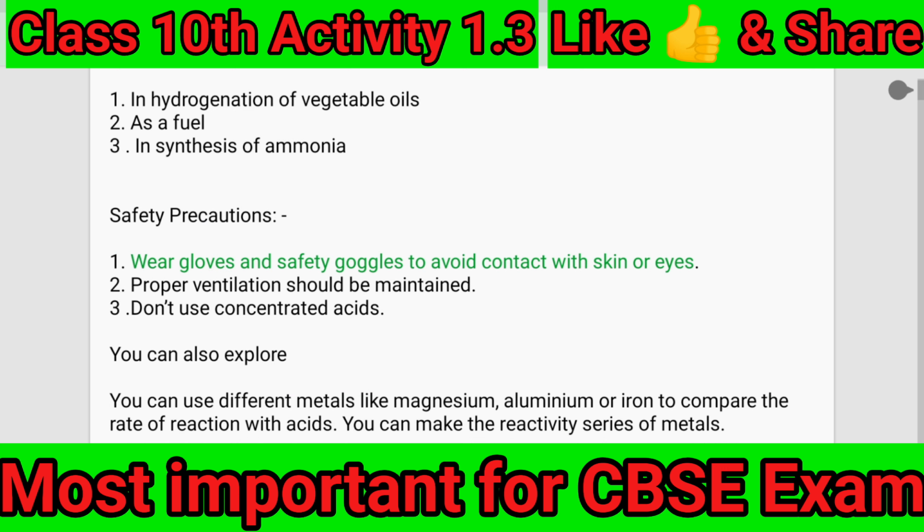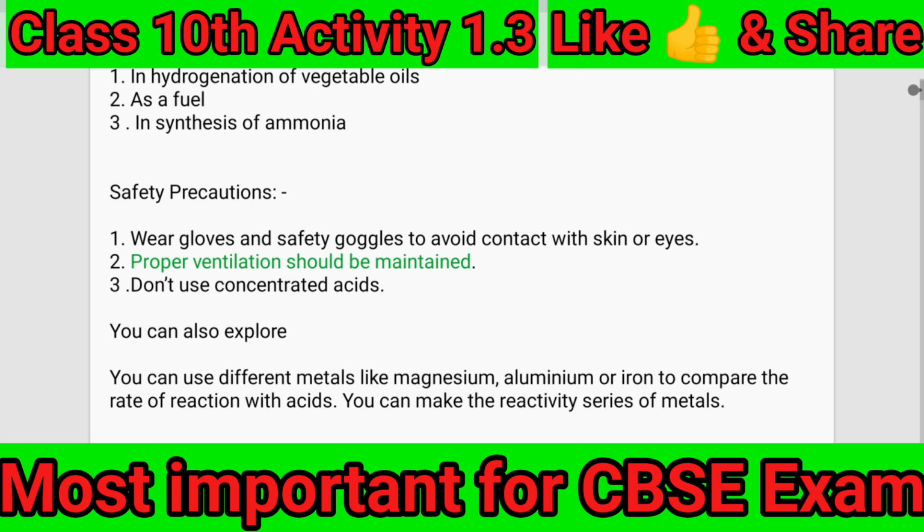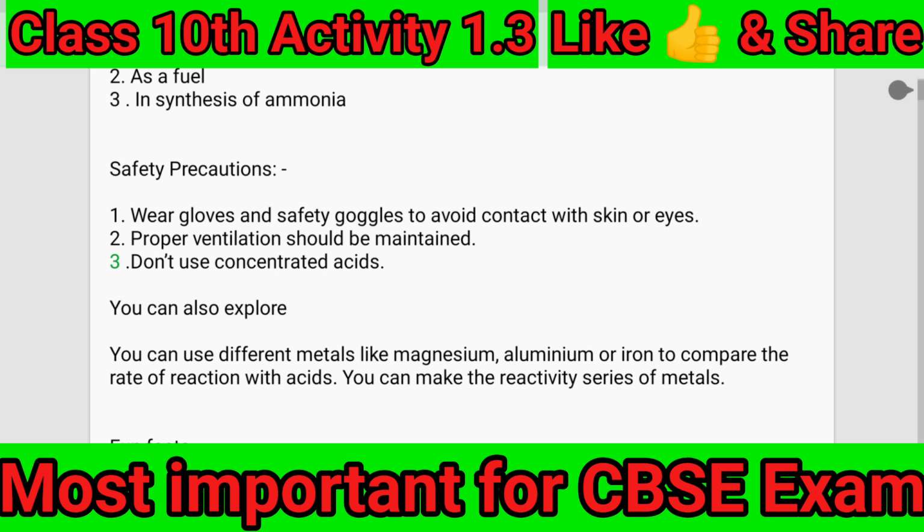Safety precautions: 1. Wear gloves and safety goggles to avoid contact with skin or eyes. 2. Proper ventilation should be maintained. 3. Don't use concentrated acids.